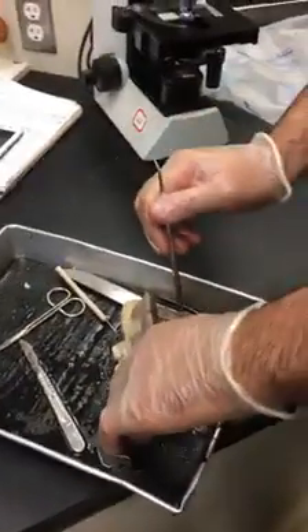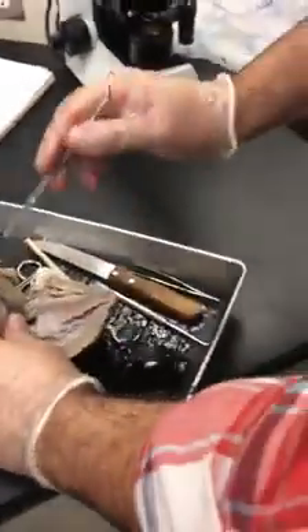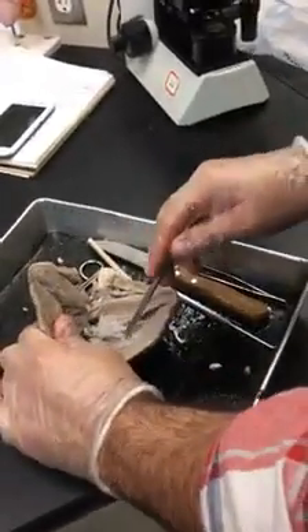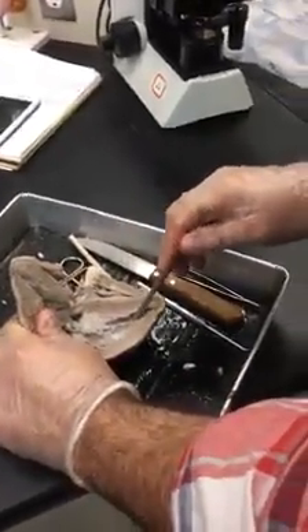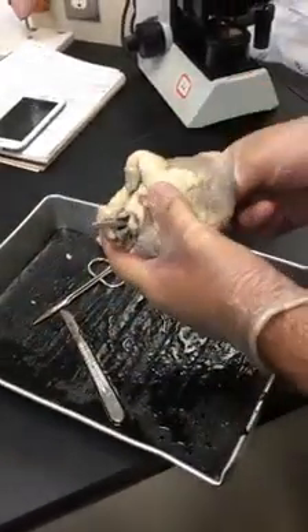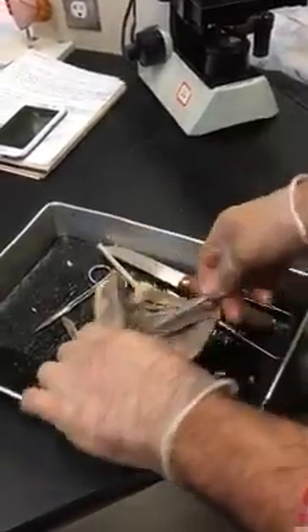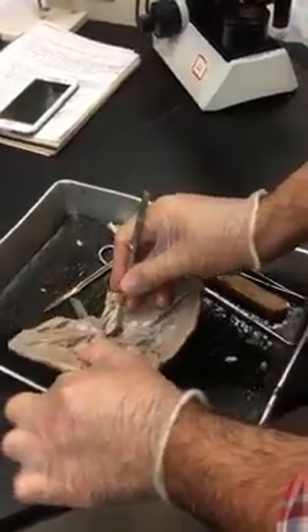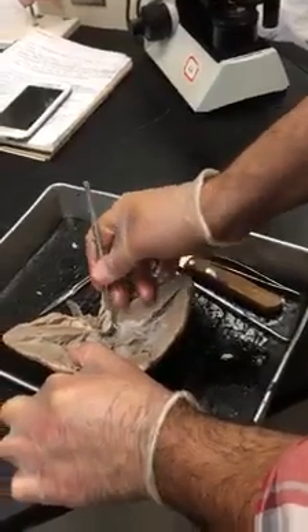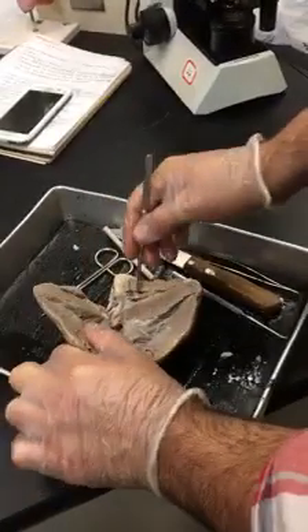The left ventricle has to lead us to the aorta. If I insert here, I should end up easily in the aorta, and I should be able to see the aortic semilunar valve, which appears as these pockets.